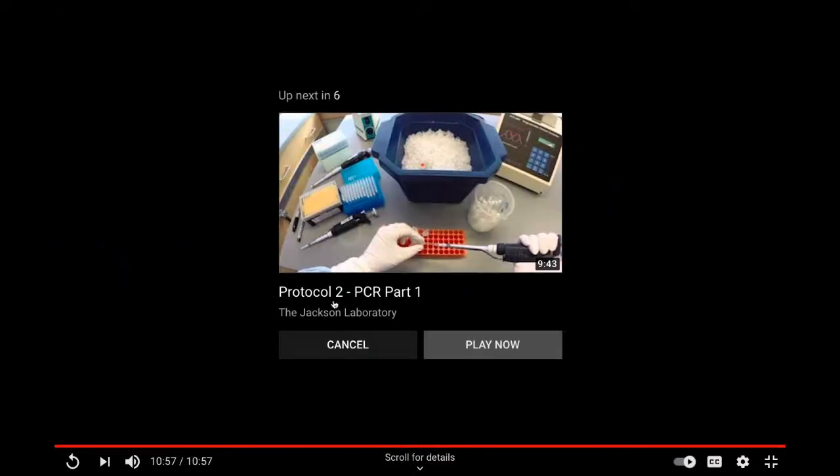So that was about DNA. Now we go for the PCR.